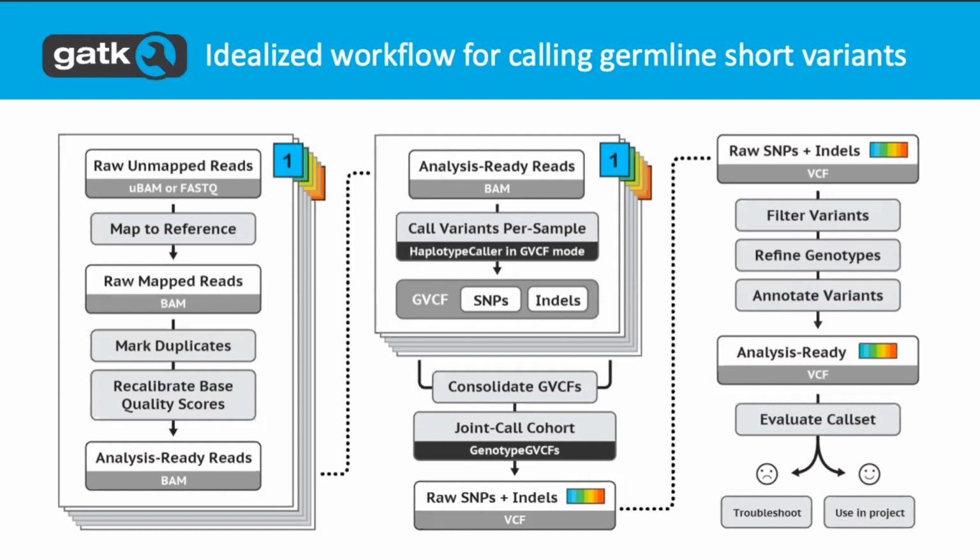You mentioned that for a single sample you use the CNN approach. Is it different from the one that Google uses, like deep learning? That's a great question. So the Google team, Google Genomics or something, came out with a variant caller called DeepVariant, I think two years ago, that is based on a deep learning approach.